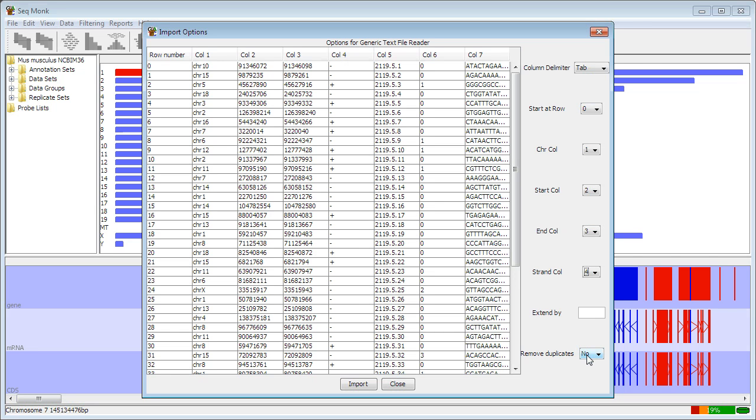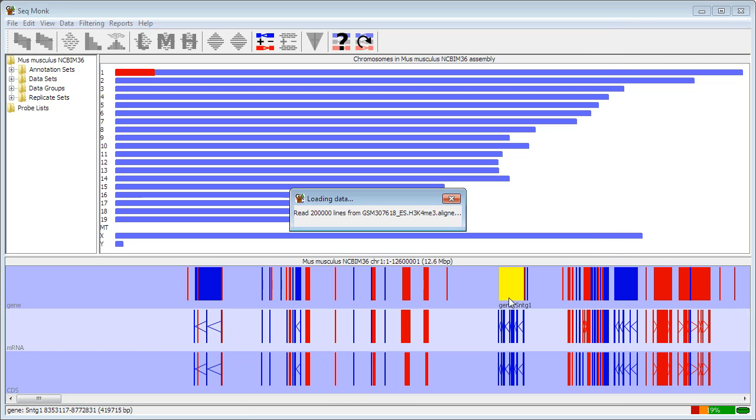And finally, you can also choose to remove duplicates at the import stage so they never appear in the program. You can choose to remove these later on and you can also ignore them when quantitating, so you don't have to do it now, but the option's there. I now choose to import the data and the data will start to come in.